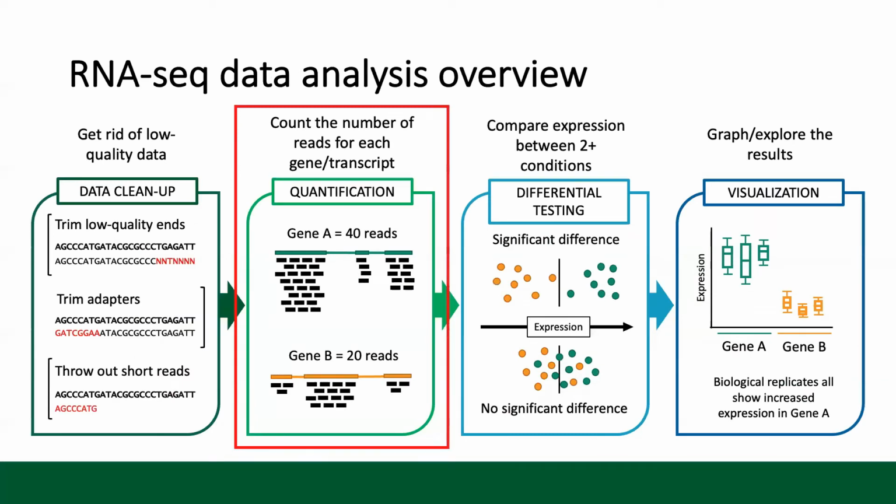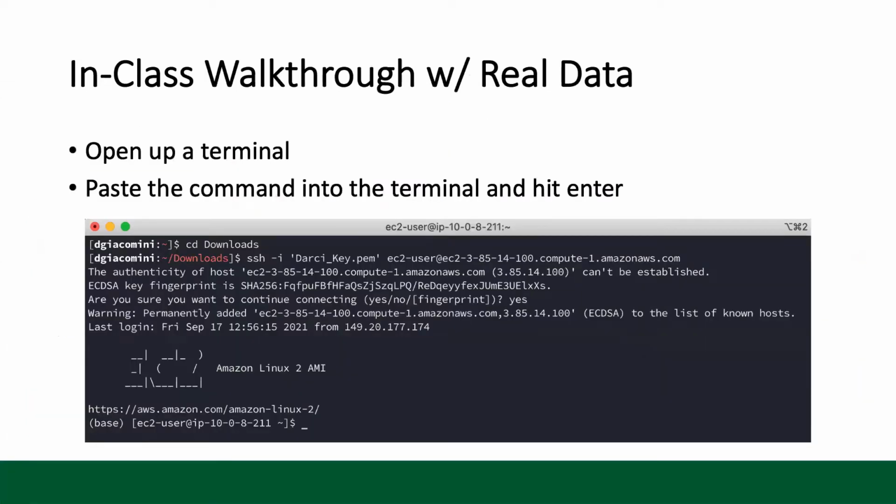Okay, so yeah, once you do your cleanup, you can actually get into the quantification step. And so here's where I will attempt to walk you through real data analysis.